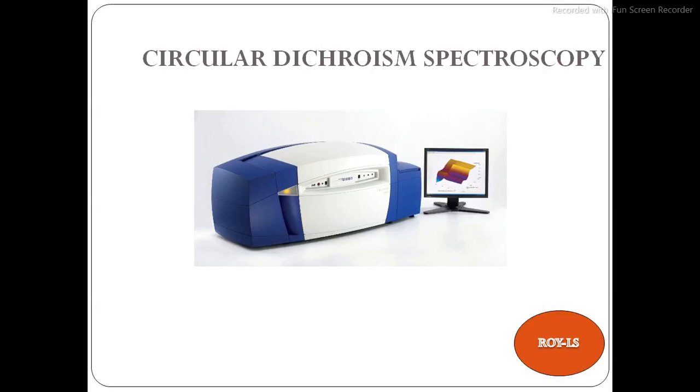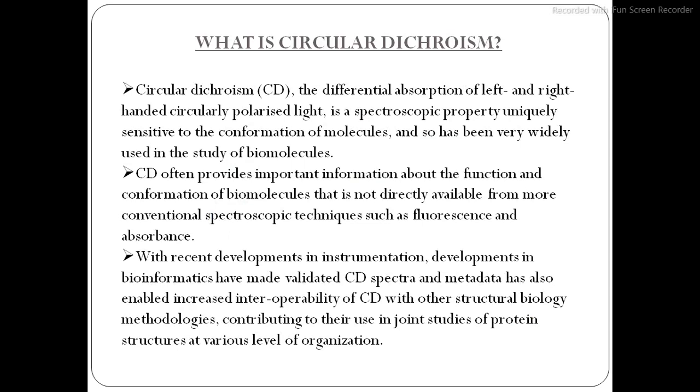Circular dichroism spectroscopy. So, what is circular dichroism?